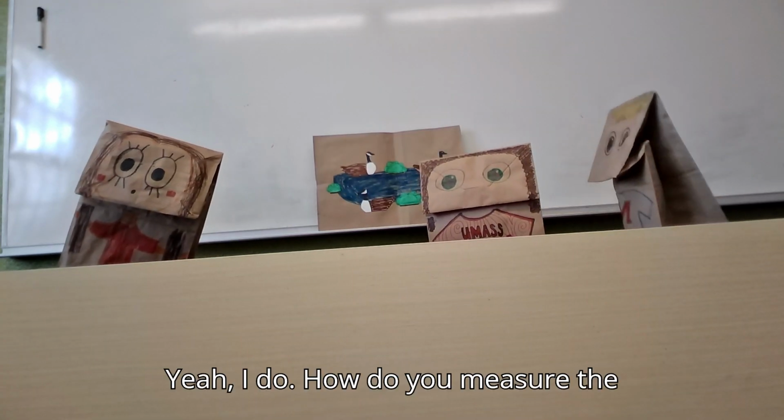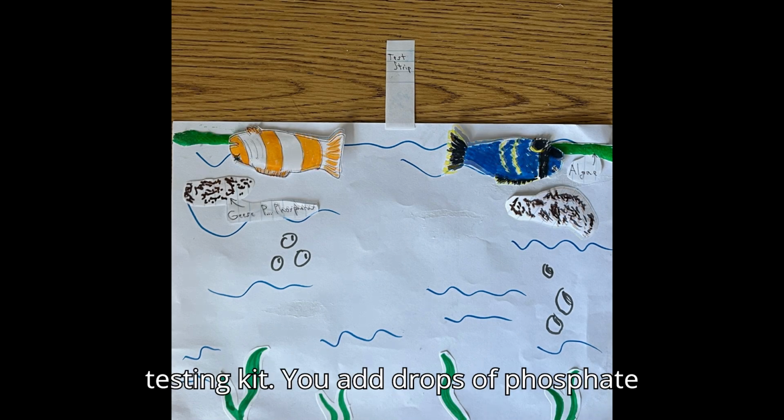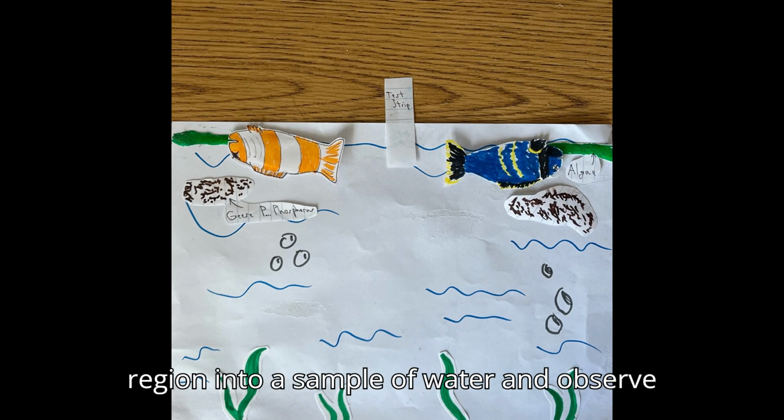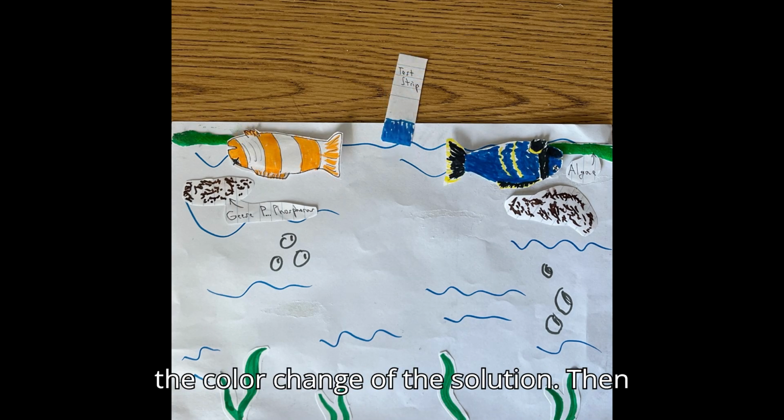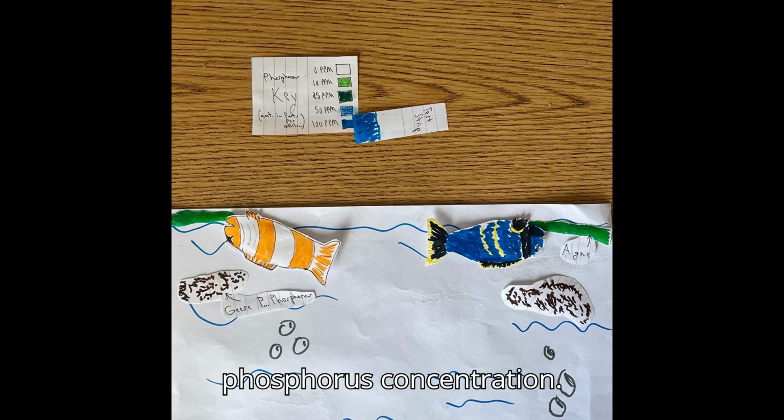Yeah, I do. How do you measure the phosphorus level of the water? You can measure it by using a pond water testing kit. You add drops of phosphate reagent into a sample of water and observe the color change of the solution. Then compare it to a chart to determine the phosphorus concentration.